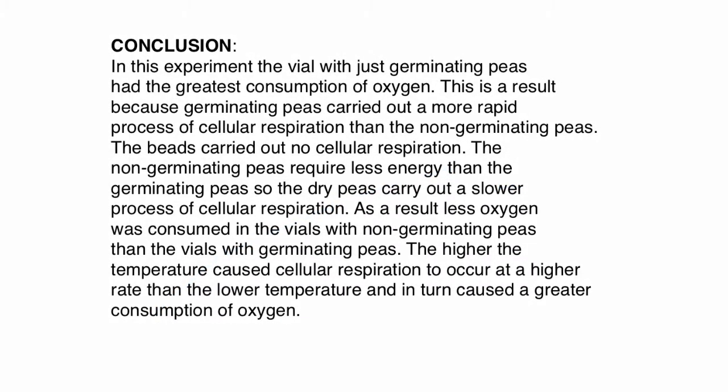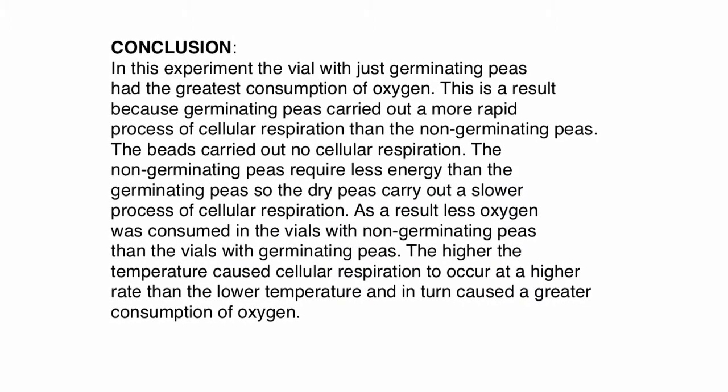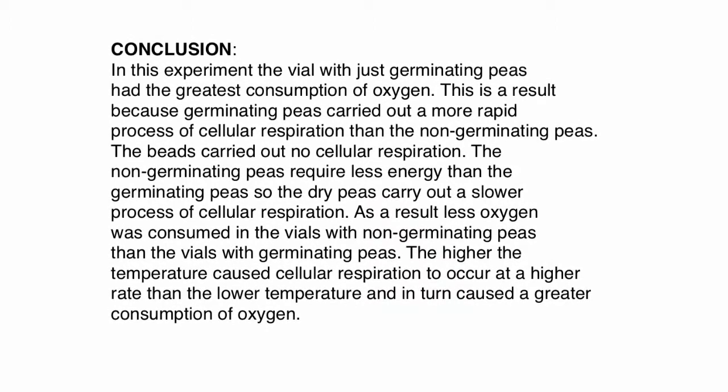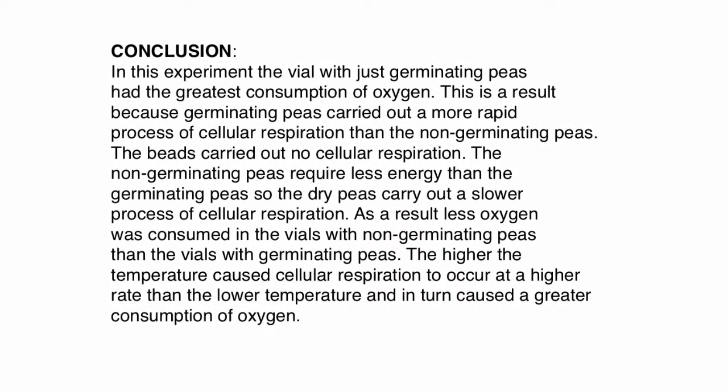Conclusion. In this experiment, the vial with just germinating peas had the greatest consumption of oxygen. This is a result because germinating peas carried out a more rapid process of cellular respiration than the non-germinating peas. The beads carried out no cellular respiration.